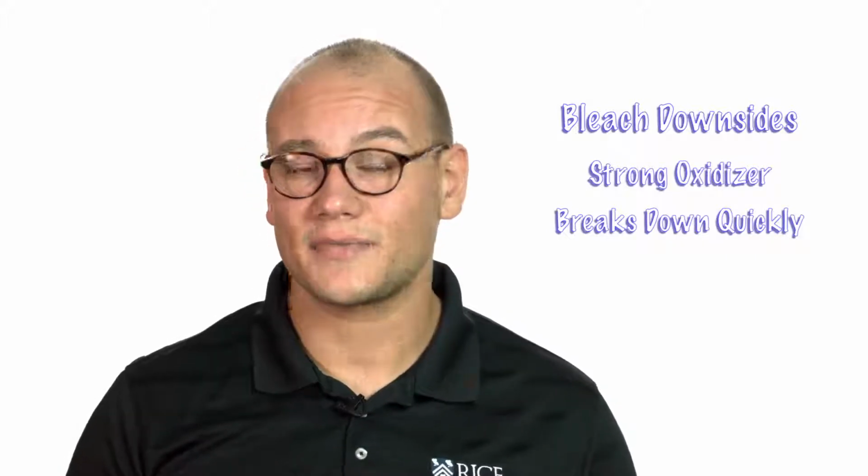However, bleach does have its downsides. Sodium hypochlorite is a strong oxidizing agent. This makes it perfect for our work in the laboratory as a disinfectant, but it also means that it can corrode and destroy the surfaces that it's being applied to. Additionally, it breaks down very quickly over time. This means that once a bleach solution is made, it stops being effective within 24 to 48 hours.